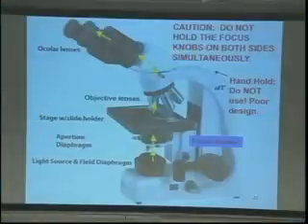These microscopes have two major design flaws. We've talked to manufacturers, tried to get them fixed. When you focus this, only use one hand. If you use two hands and you hold the one on the left tight and don't allow it movement and you do the right one, you will snap the rod that goes between those two. So only one, or if you want to do two, very gently hold it so it can spin. That's one bad design flaw.